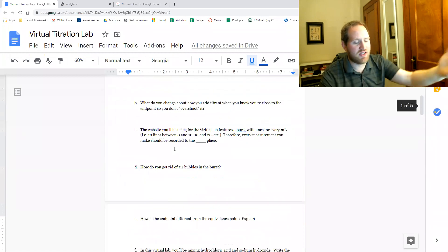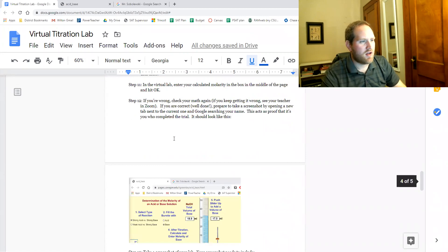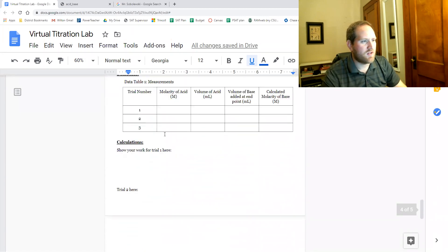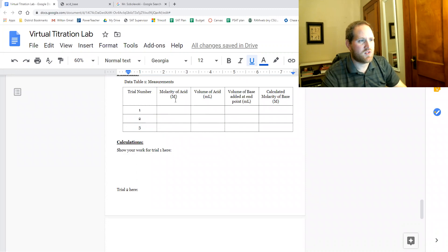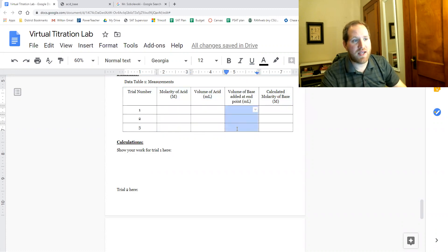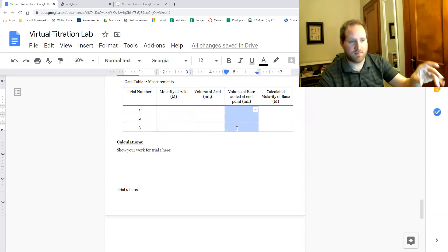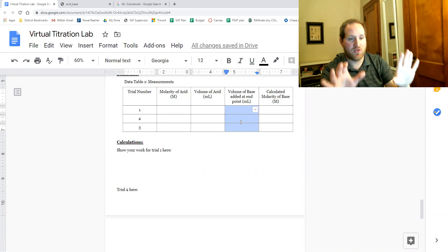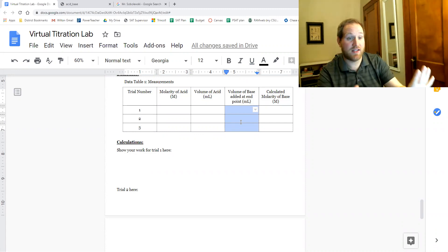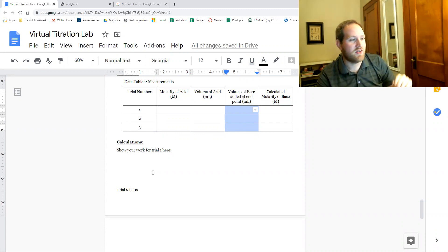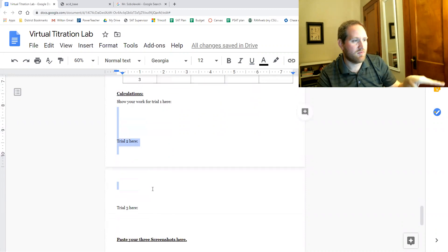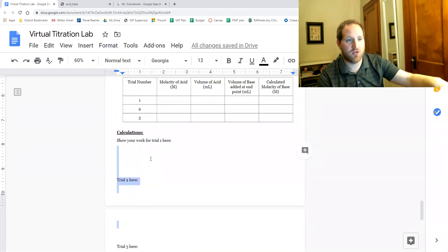So in terms of what you're turning in, make sure your pre-lab questions are done. Make sure your data table's filled in. So this is the molarity of the acid, the volume of the acid. These are the knowns at the start of the lab, the volume of base added at the endpoint. That's when you successfully get the endpoint, that's where you enter. And then you do your calculations here, make sure your work is shown.